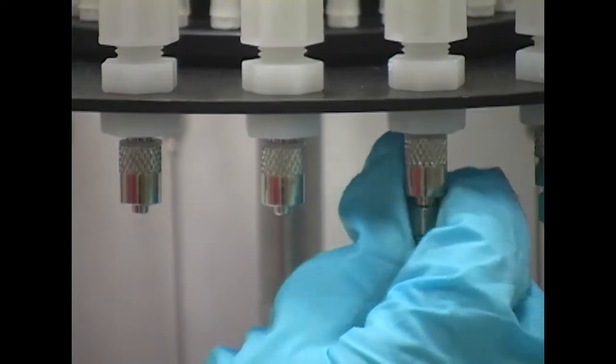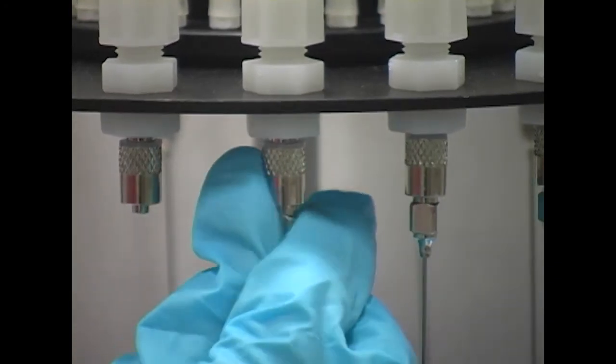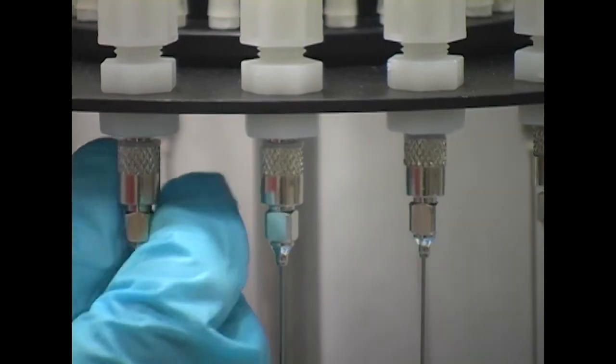Stainless steel needles are supplied with every purchase of an EnEvap. Install the needles into the lower fittings at the bottom of the valve tube assembly by rotating the needles half a turn. Do not over tighten.